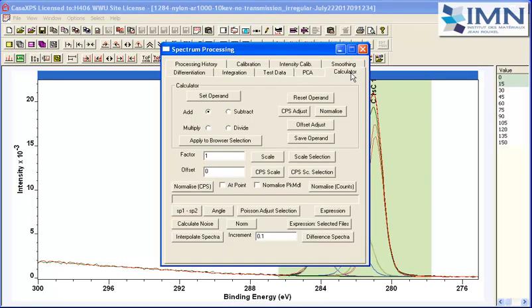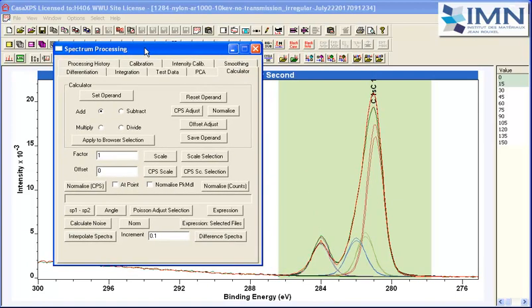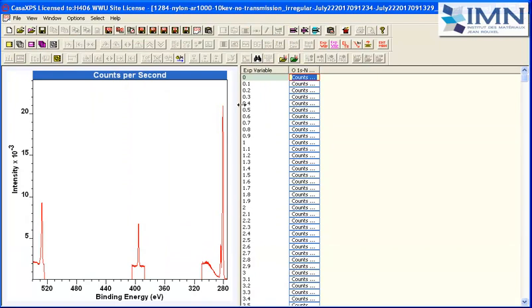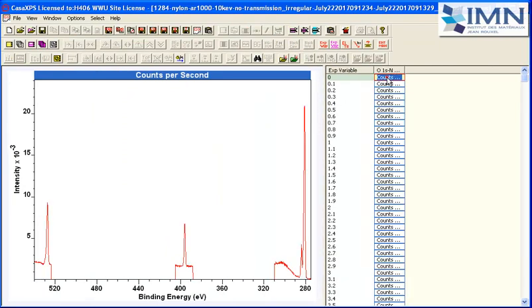So we're going to use an option on the calculator where we can calculate a sequence of different spectra. In this instance, we've got two spectra that are very similar in intensity but slightly different, and so we don't have to do any pre-processing of these data to do this calculation. We'll just take the difference of these two sets of data, and having taken the difference, the idea is that we start off with the two forms as the first and the last in this list. So when we overlay these, they are exactly what we saw before, and then somewhere in the middle what we will find are spectra that have different characteristics from the ones that we measured.